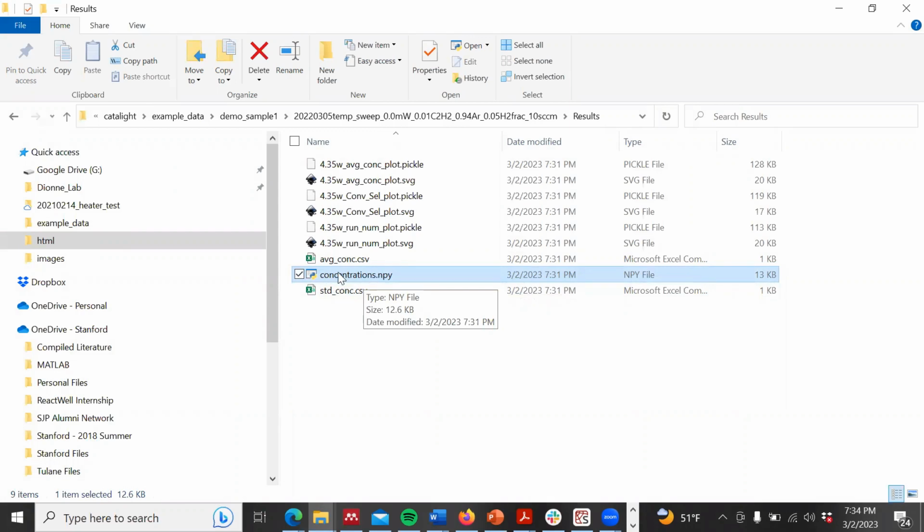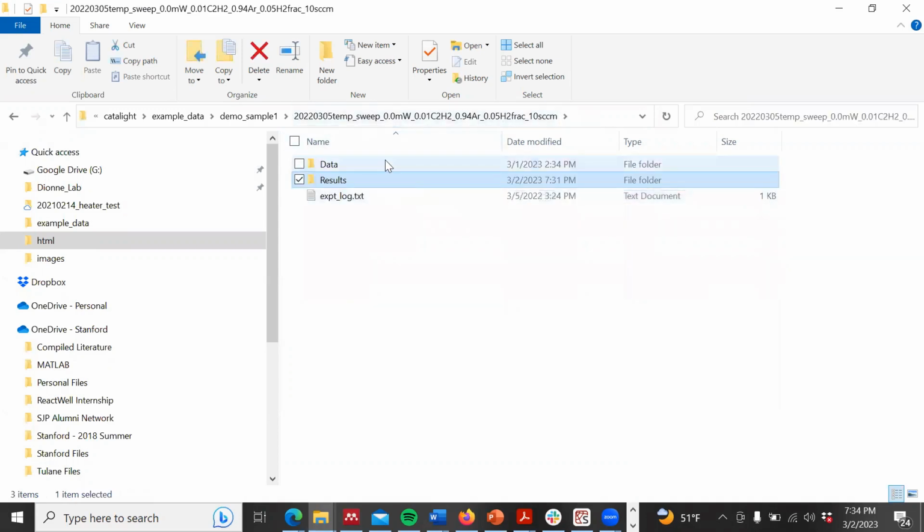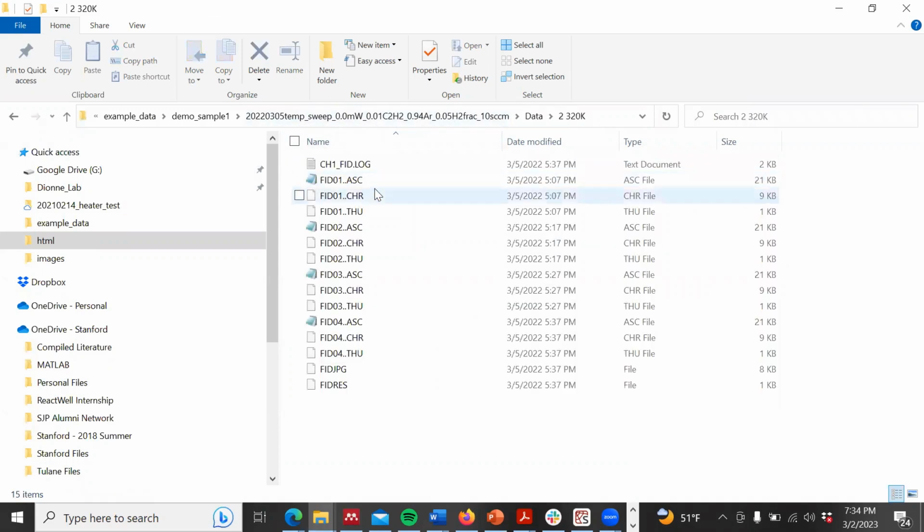When you import that, it contains the ppm concentration and the timestamp for every single molecule, for every single run number, if you run duplicate runs, for every single condition for your experiment. So basically, anywhere you have one of these ASCII files, you have a NumPy array for every single one of these, which gives you a 3-dimensional data set.